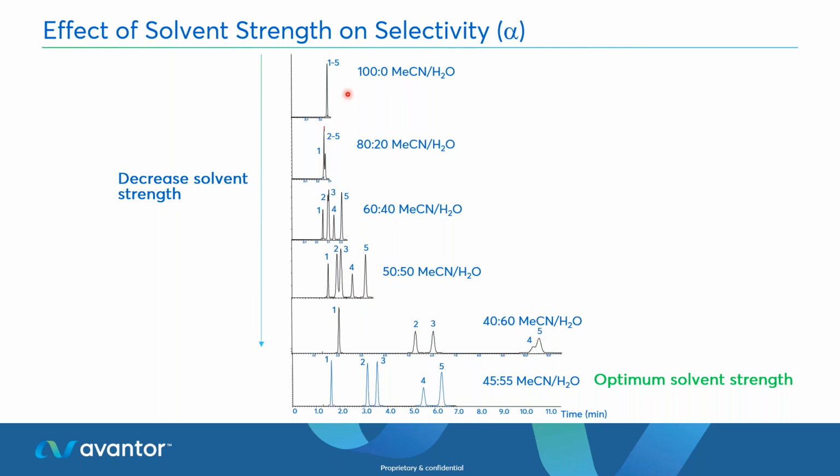So I would suggest that if you're going to use this as your experiment to find the right concentration of acetonitrile water, don't just change it by 10%. Do make sure there's a significant change in the percentage, 20, 30% ideally. We'll really start to see if this is a good way to go.